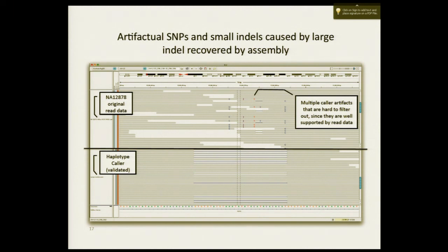It's just something that probably is going to happen. So insertions of the same size, of course, you're not going to get because the reads were actually not mapped. OK. Yeah, so there is sort of a bias there. But I mean, for 22 bases, it'll be in there, right? Because what will happen is the read will come so far, and then it'll start reading into the insertion. The aligner won't know what to do, so it'll just soft clip those reads, right? Or hard clip those reads, or whatever it does. Soft clips those reads, right?